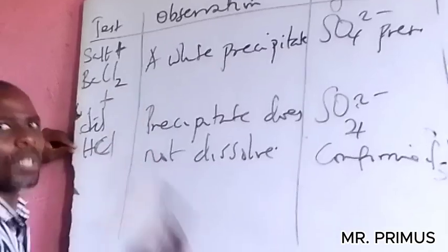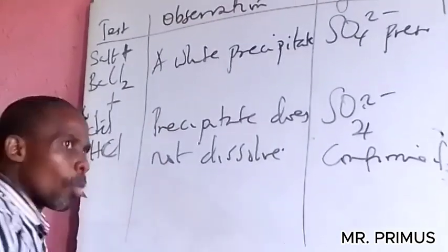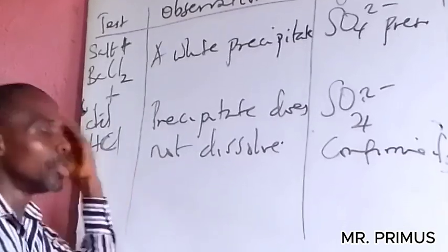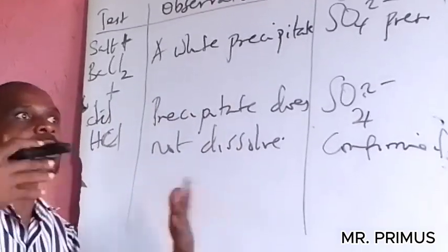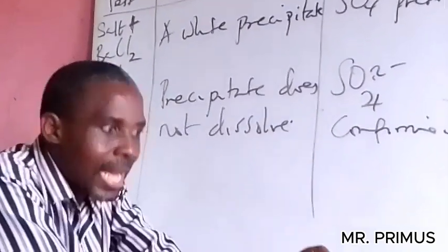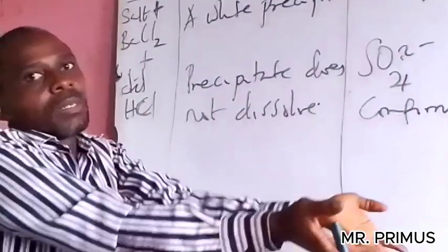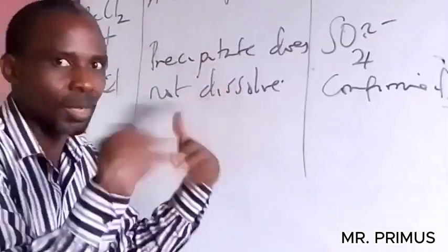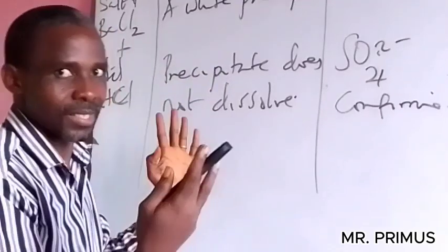So this is a typical qualitative analysis, both in WAEC and GCE. In WAEC you have to perform the experiment, but in GCE you need to know it. That is why they say GCE is more difficult than WAEC. Yes, because in WAEC you can practicalize it and see, observe, but you must know your inference. So if you know this, you can answer anything, you can teach anybody on qualitative analysis.